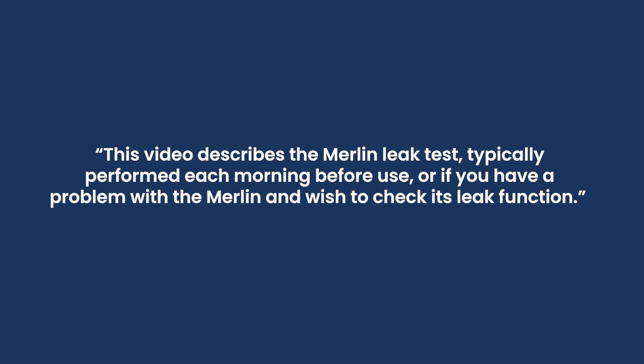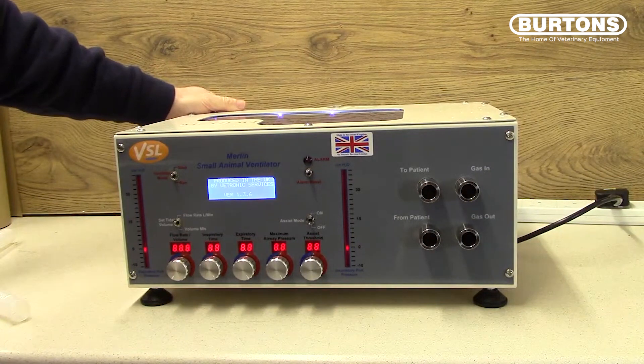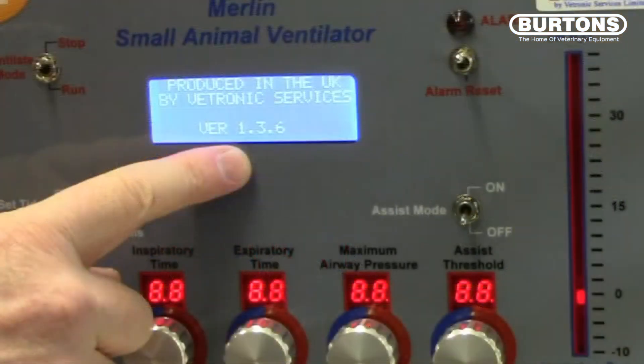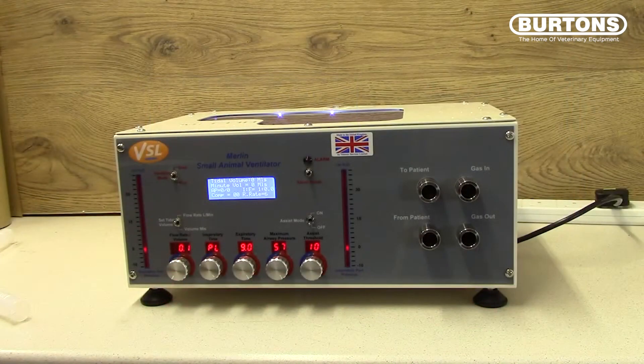This video describes the MERLIN leak test, typically performed each morning before use, or if you have a problem with MERLIN and wish to check its leak function. Turn MERLIN on using the switch at the back. For reference, the software version number will appear on the screen as it starts — you will not need this number for this procedure. Set the controls in the following manner.